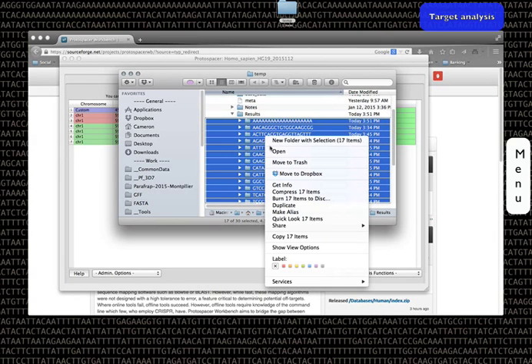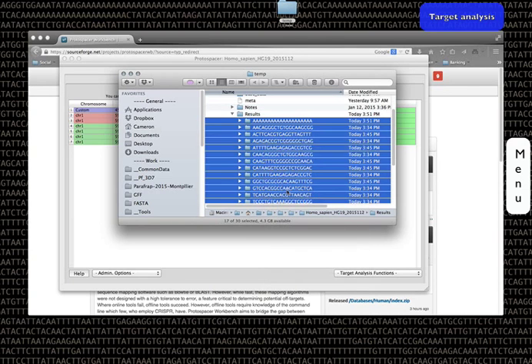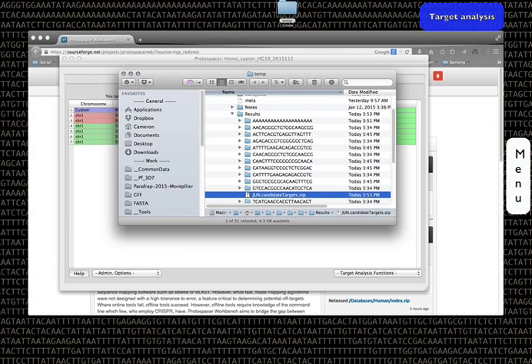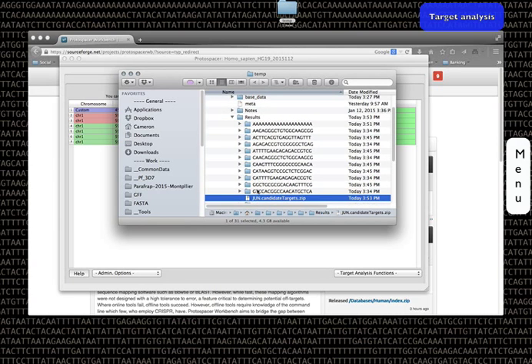We can compress these 17 results into an archive. This archive can be backed up for later use, or sent to a colleague for their own analysis, provided that they have the same database. Databases are the same, provided that they were created from the same FASTA sequence.